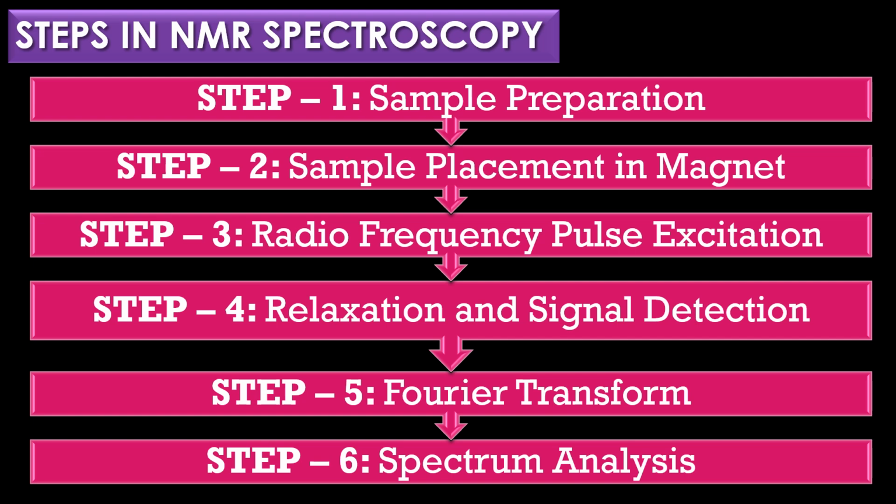Finally, step 6 is spectrum analysis. The resulting spectrum shows peaks which correspond to different nuclear environments in the molecule, which can be analyzed to determine the molecular structure.